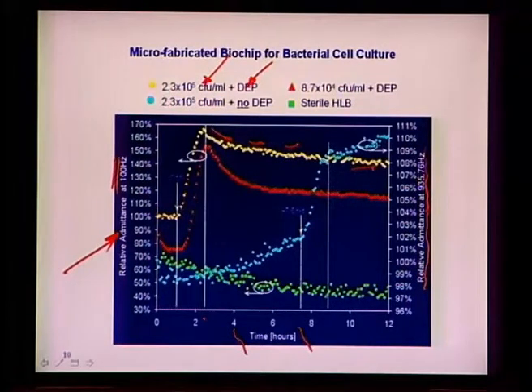What it also leads us to believe is that the cell cycle of growth is really in this particular chamber for only about 2.5 hours or so, where the maximum growth rate is reached, beyond which as the cell cycle falls down, or as the competitiveness grows up between the cells competing for probably nourishment, etc., there is a loss in viability, and that is represented by a fall down of the impedance spectrum, as you can see here.